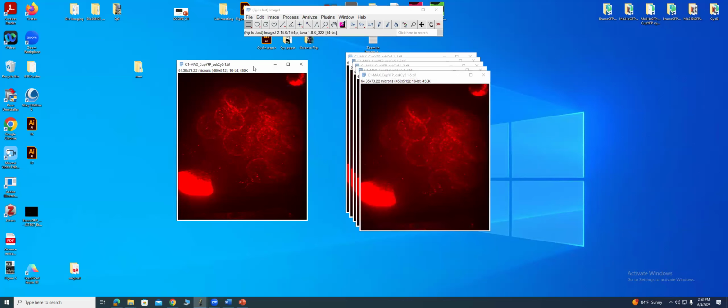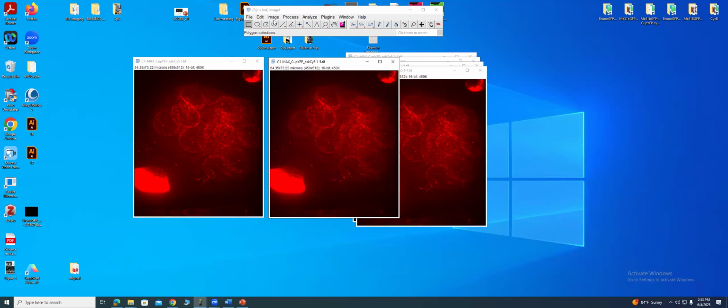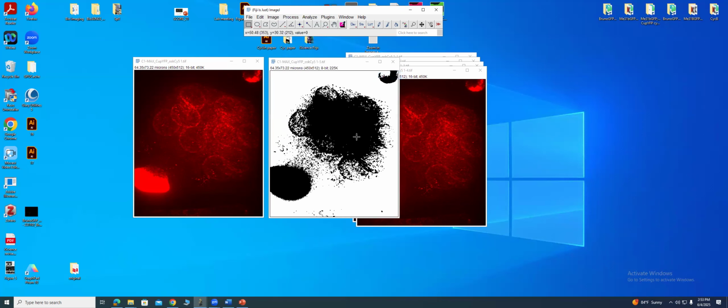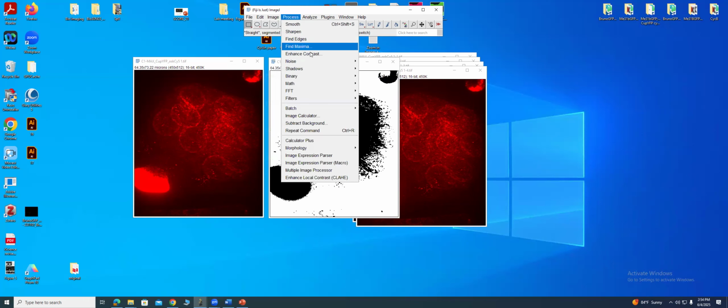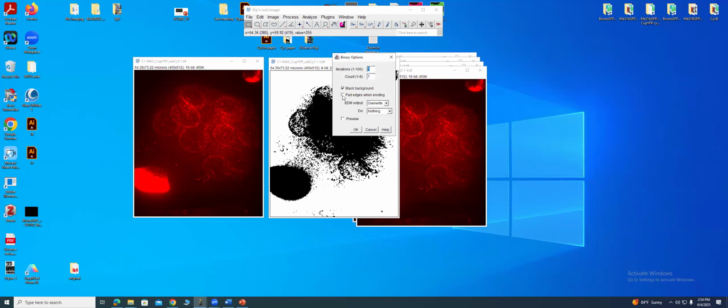Okay, so I made just a bunch of them so I don't have to keep reopening. We can go into binary, make binary, and see it automatically said that this is 255 and this is 0. What did I say? This is not the correct one, right? So we're going to go ahead and go to binary options. We're going to make the background black. Oh, but I have it clicked.